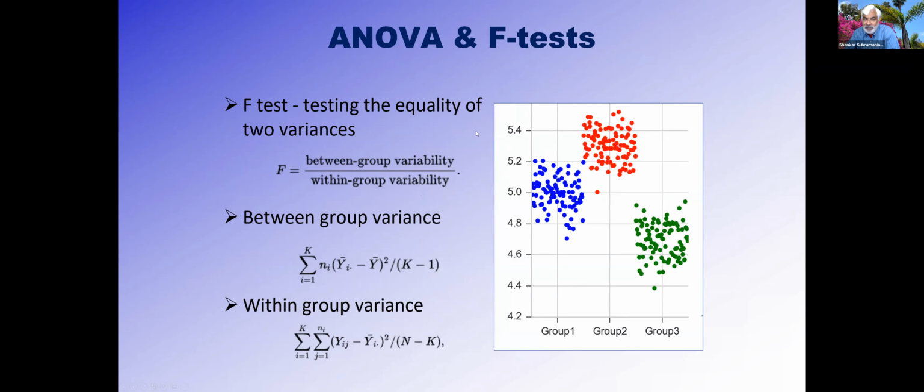So therefore, I can calculate the between-group variance and the within-group variance by doing an F-test: between-group variability, within-group variability. Very useful tool, because when you do lipidomics experiments, sometimes your experimental condition is such that within a given sample you'll have much more distribution than between treated and untreated, as opposed to between just untreated alone or treated alone. So you need to pay attention to this.